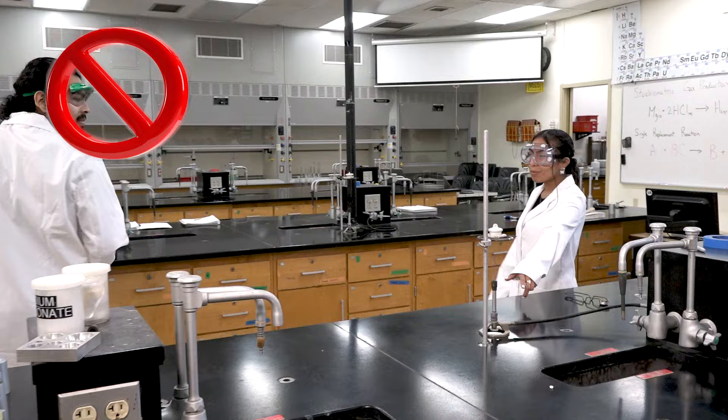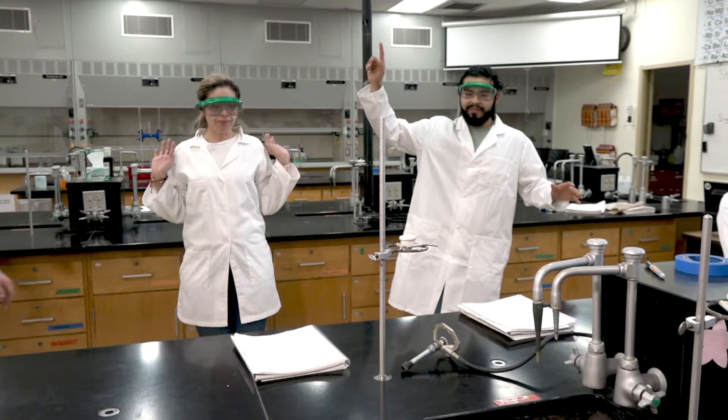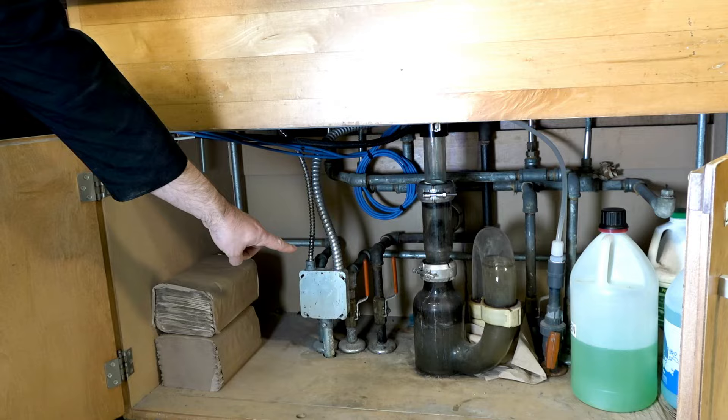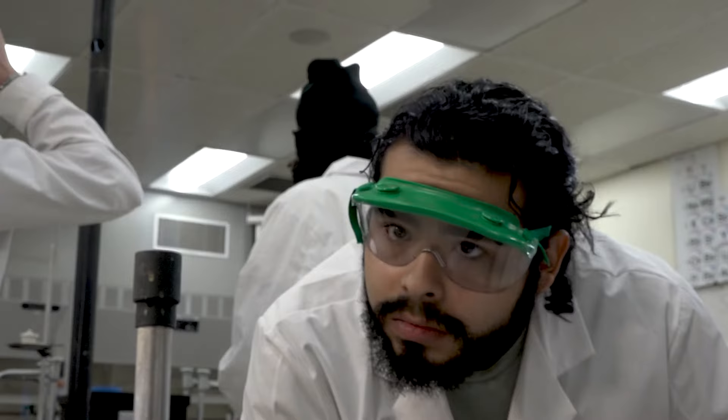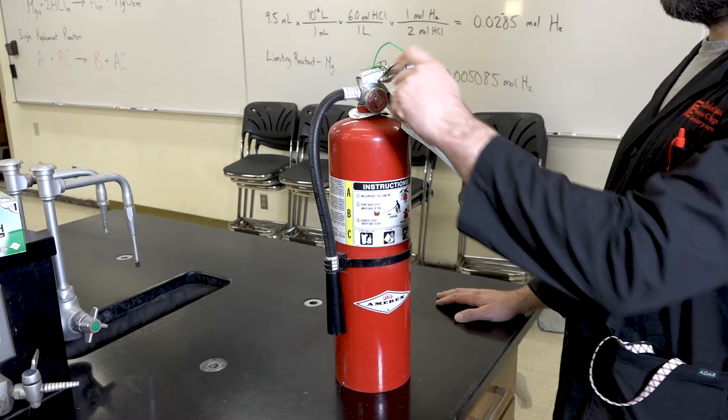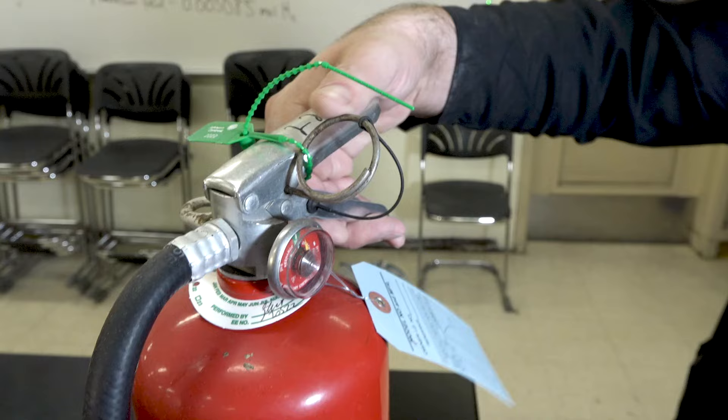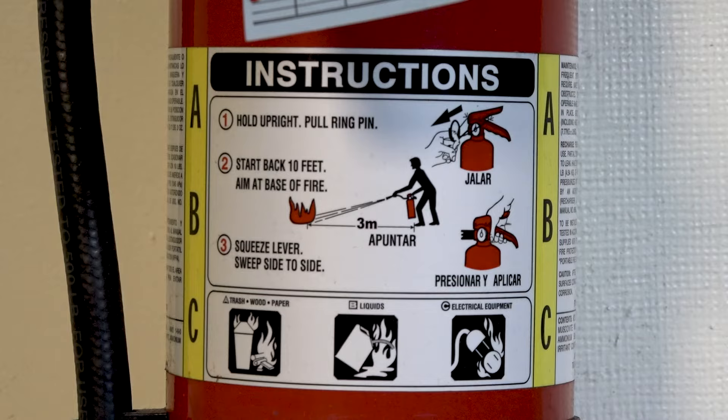If an accident with your Bunsen burner does occur, for example gets knocked over onto its side, the first step is to always make sure to get yourself out of harm's way. Then, if possible, turn off the gas source to the burner to extinguish the flame. In case of emergency, there is a main gas shutoff valve located under the sink at the end of each bench. In case of a serious fire accident, it might be necessary to employ the fire extinguisher. To operate a fire extinguisher, pull the pin from the handle, point the nozzle towards the base of the fire, and squeeze the trigger. The dry chemical foam inside the fire extinguisher does cause a bit of a mess, but will safely extinguish the fire.